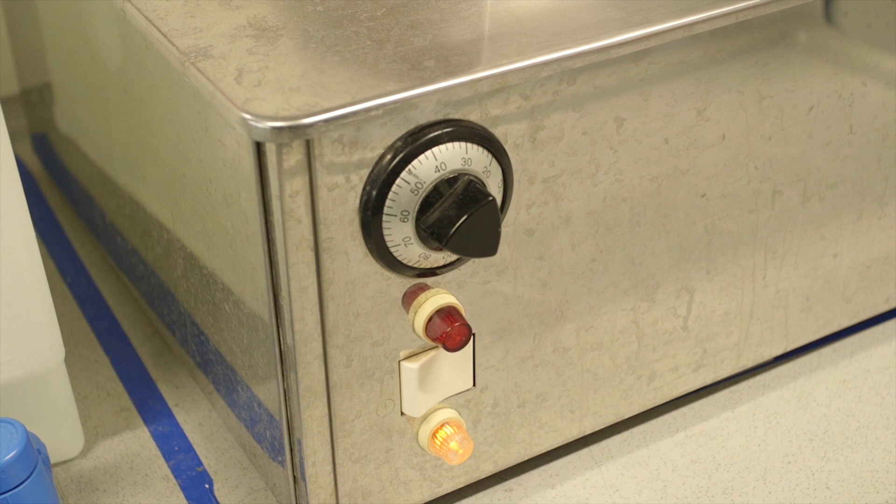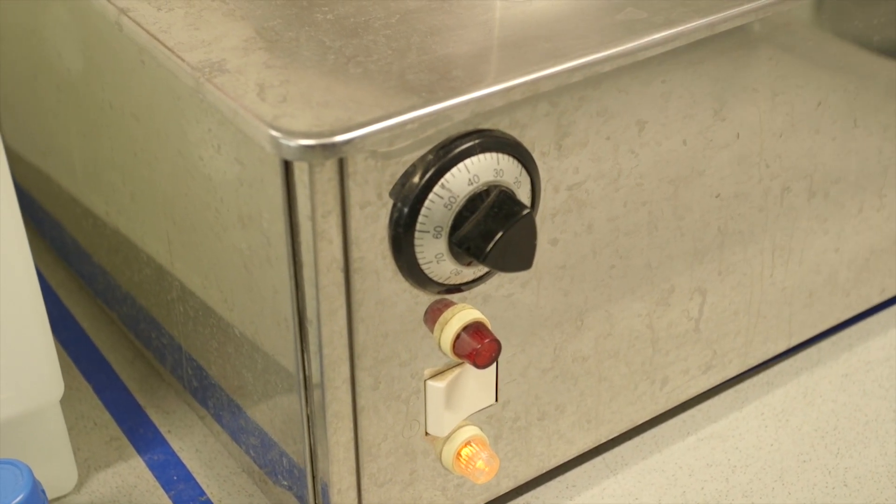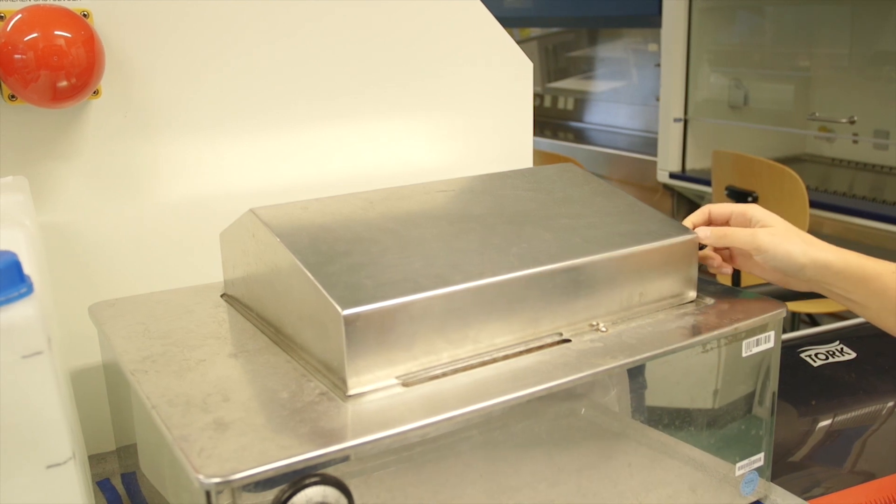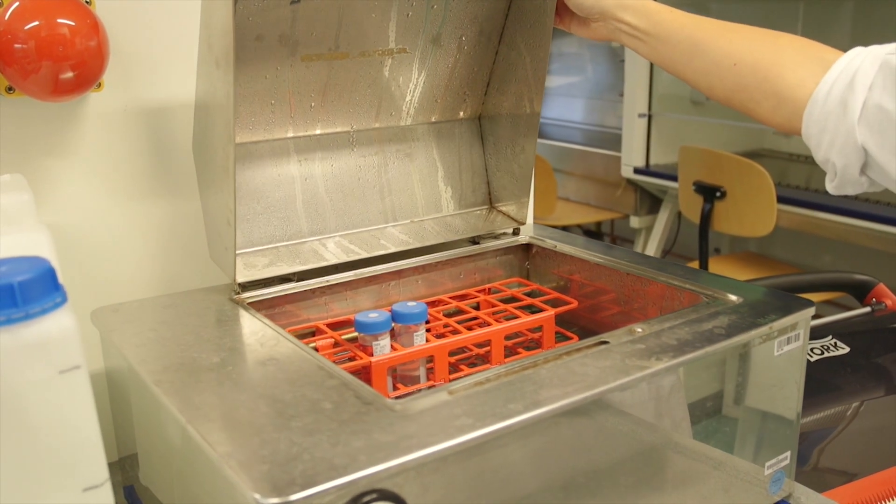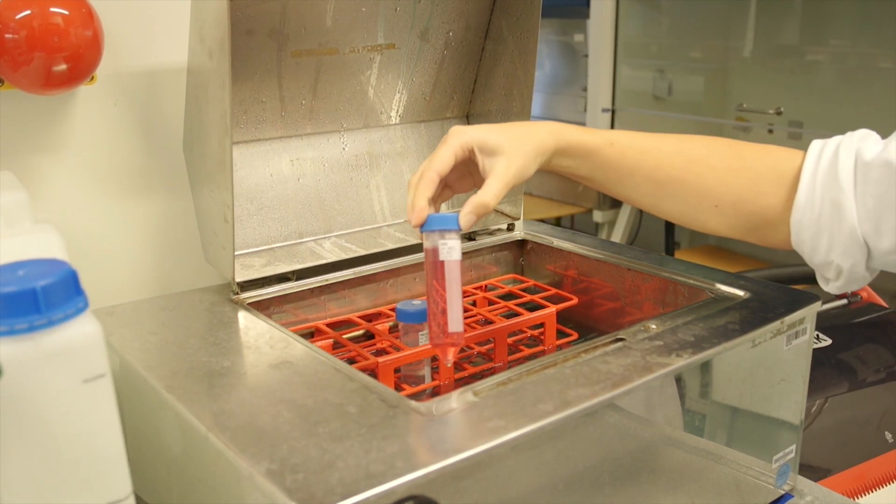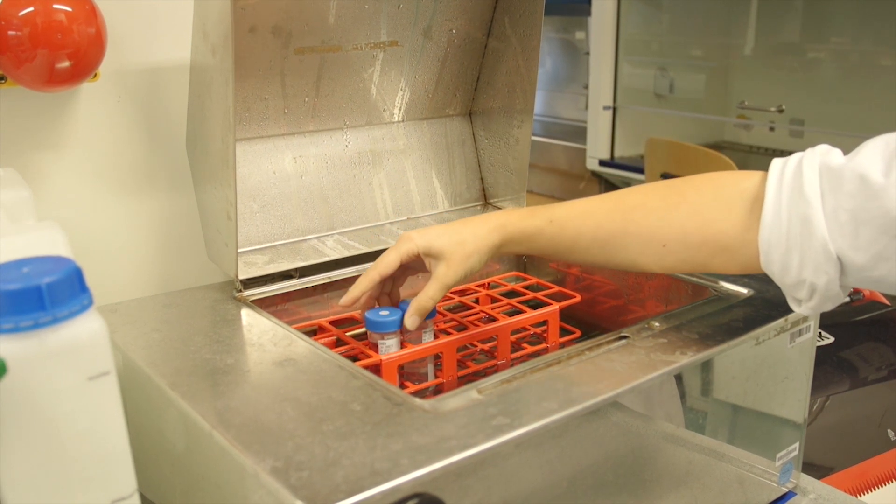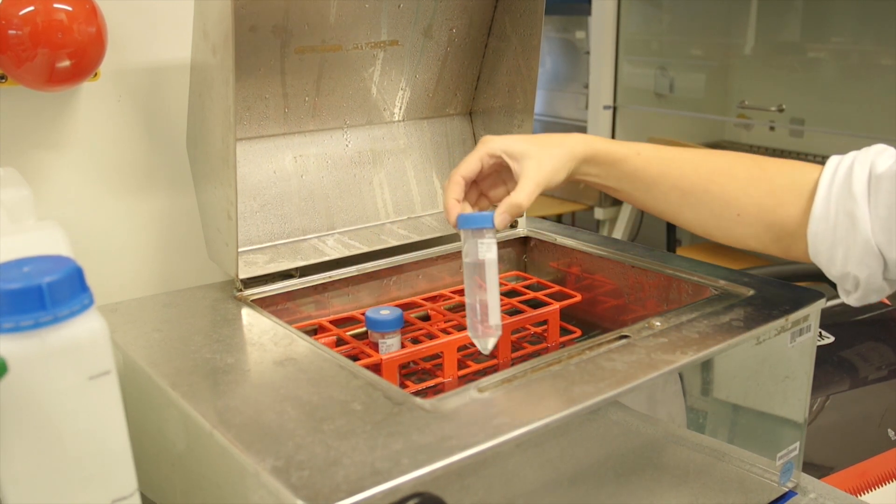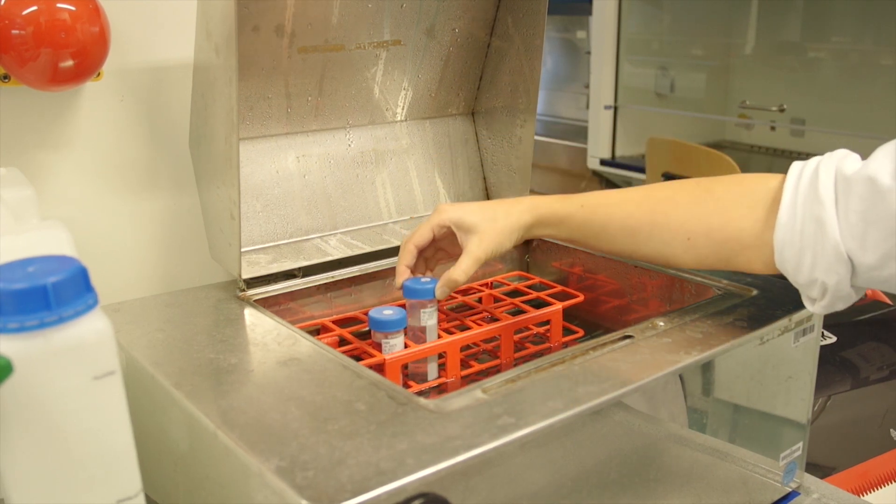The medium and PBS should be warmed to 37 degrees Celsius before use. Turn on the water bath and make sure the water level is high enough, filling with demi-water if necessary. The media should be at the required temperature when needed, but don't let them stay too long in the water bath. Importantly, trypsin should not be put in the water bath.